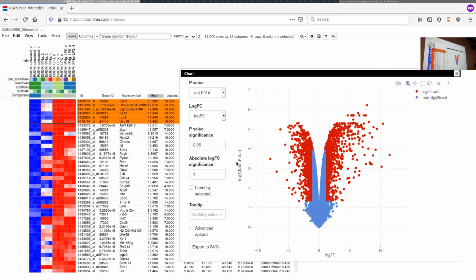So basically, if you have on average a big log-fold change, you'll have a highly significant p-value. However, it's not that linear, because aside from the fold change itself, in the t-test and any other test, variance is important.